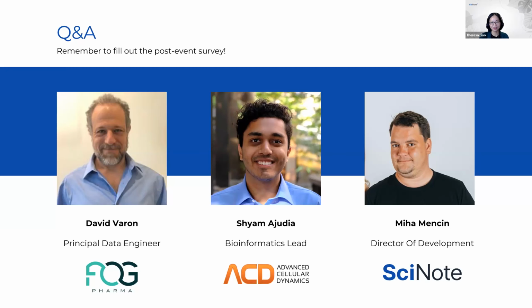I mean, at the end of the day, I will reach out after the webinar to see whether perhaps our customer success team or even Miha can provide some input when we better understand the actual, specific needs and how we can address that. But I don't know whether Dave and Shyam might have any thoughts on the possibilities? And Shyam, especially, you mentioned stock management earlier with the API use. I mean, it sounds like it should be possible, but you do need a scale that can communicate, is the main thing.